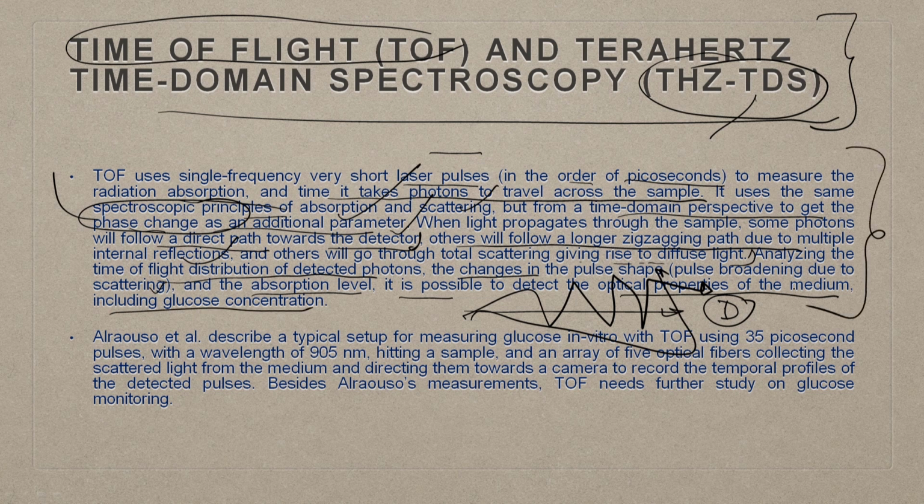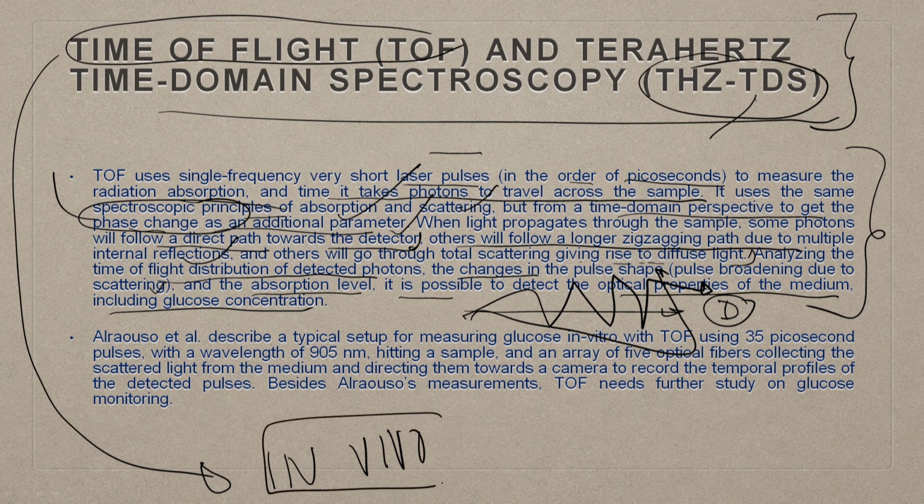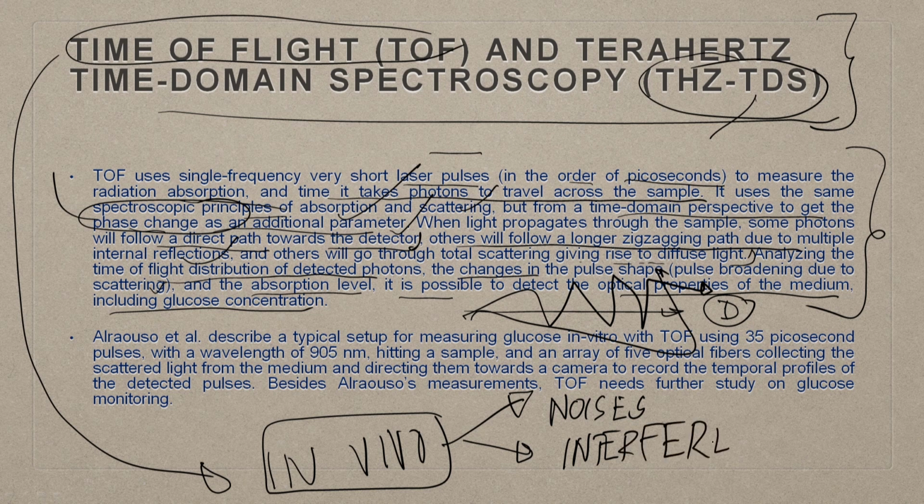But when I am making these drawings, you must have realized that when we are talking about doing such analysis in vivo, there are a lot of noises and interference. If we could bring these down, then definitely one can get a very unique signature.